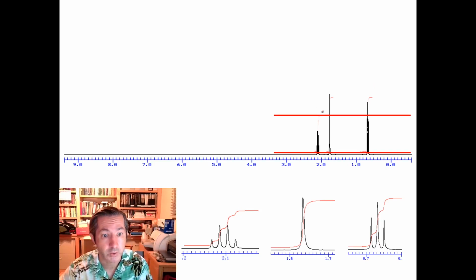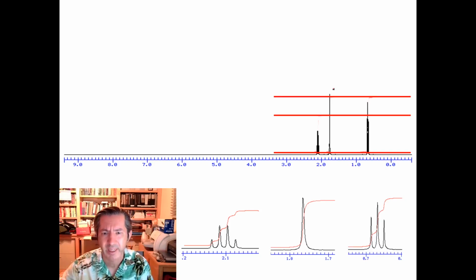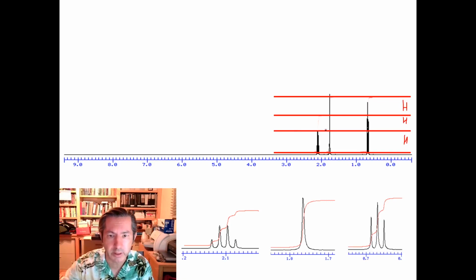And so I start to construct my hydrogen ruler. So I ran a line right through here. I'm going to put one up here. And notice the spacing here is different than the spacing here, so I'm going to throw in an extra line. So this is my ruler. And what you'll notice is, remember, we're not going by the height of the signal, but by where that integration line goes.